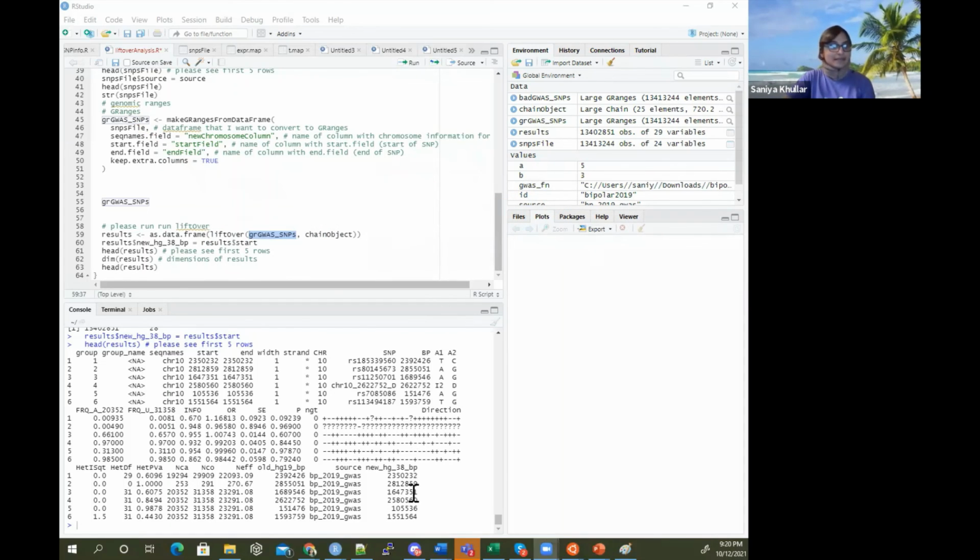And then in the end, we have what we wanted, and that's great, so yay, we just finished doing the conversion. That's how I got by with trying to do the conversion, and I'm still working on that. I just found out how to do this conversion, so I'm sharing it with you guys to help you out if you have similar difficulties. So how do you change genomic coordinates? I hope this helped you in the process of doing that.